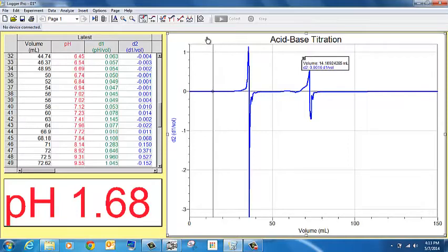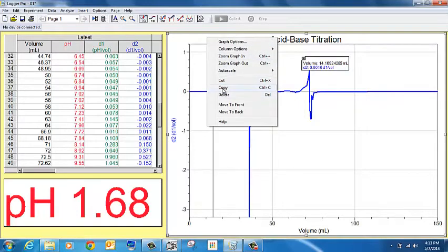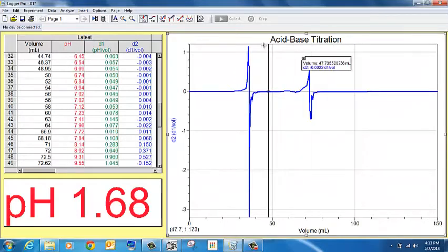So you want to copy this graph, right click, copy. Now what you can do if you're really good at this and you want to be really careful is to put your vertical line here, your interpolate line, and find the point where you want it to be. Let's say, really big jump there. See where it's going back and forth between above and below zero there. That's pretty close. And that says 36.05 milliliters. There, 36.02 milliliters there, pretty close to where we were before. 36.00 is what we assumed it to be in the first derivative graph.